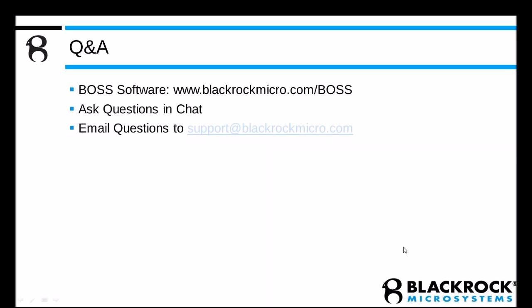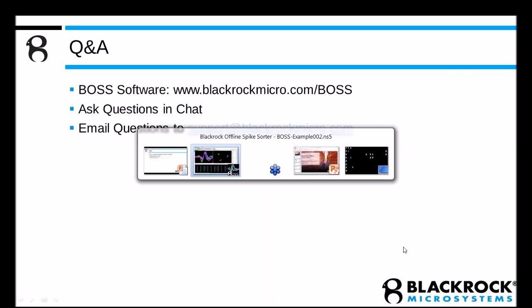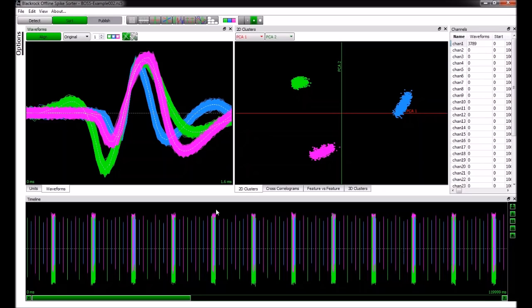Nick, the question is, how do we merge two different units that were identified as separate, but visually look to be the same spike? How do you do that? Is it possible? As the answer in chat appeared very easily, basically all you need to do is highlight the waveforms that you think should be part of the merged unit, and then click the drop down to select the other unit, or combine them.